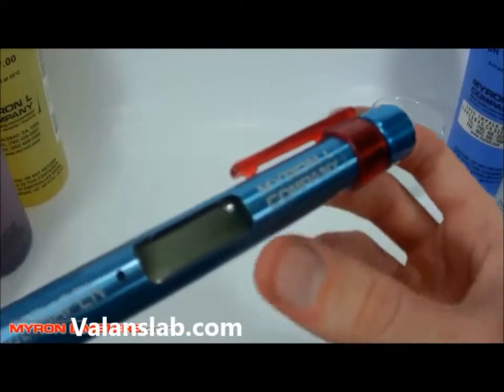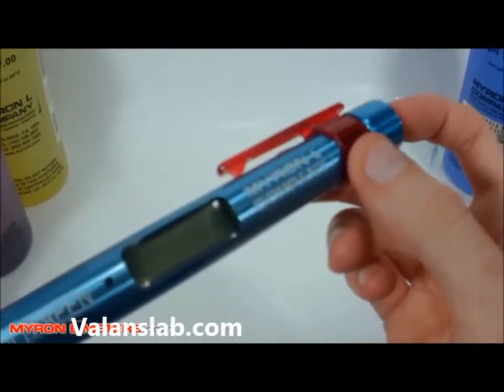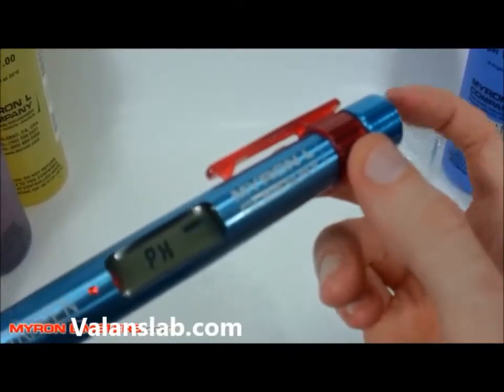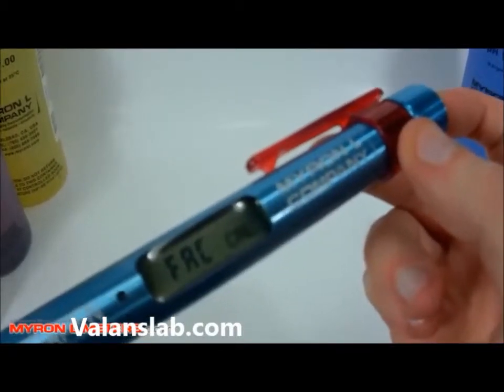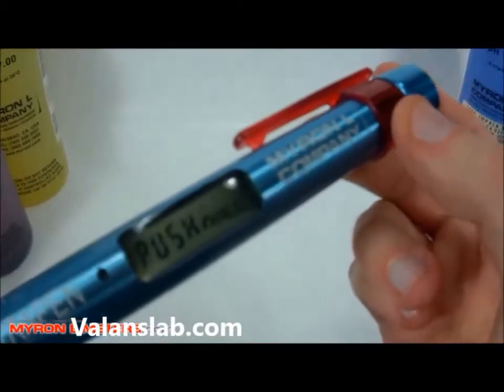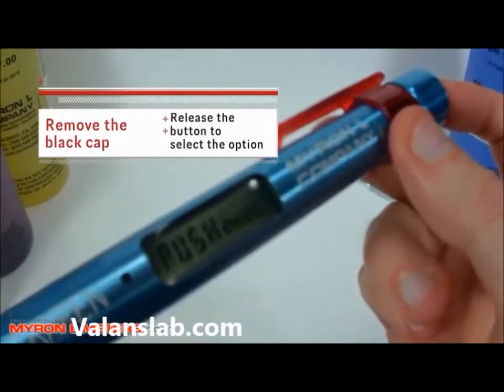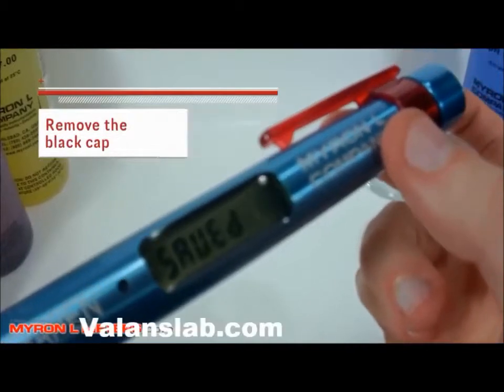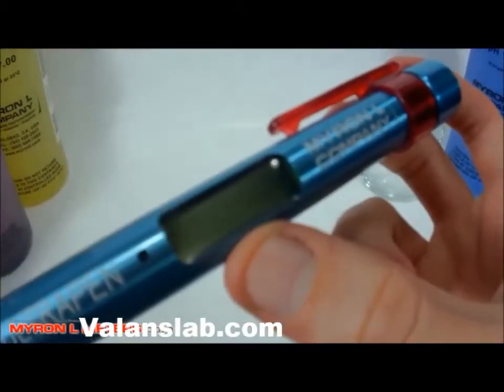Let's check out the pH mode selection option. We'll turn the instrument on, press and hold the button — this shows us the different menu options. We're looking for mode selection, so we'll release now. It tells us to push and hold, so we press and hold the button again and it gives us the option of hold or live. Let's try live mode. It shows us that the option is saved.